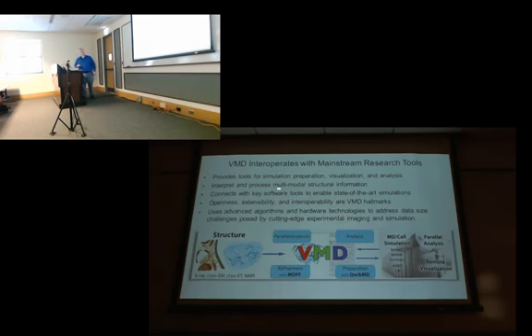So VMD incorporates tools for preparing simulations and analyzing and visualizing the results of those simulations. And this is, as I say, the bread and butter of the program. In recent years, we've put a lot of effort into extending the program to interpret and process multimodal structural information. So when you have a combination of X-ray crystallographic structures and information from cryo-EM or cryo-electron tomography experiments, you can superimpose those, dock those together with some of the tools that are included with VMD and NAMD, and it, of course, connects with many other tools in the field.